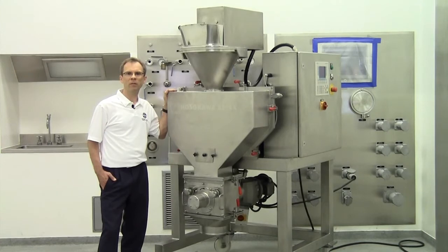The Alpine Pharma Pactor is a lab and small production scale compaction system designed to increase the size of powder particles into granules or flakes. This unit is capable of compaction up to 300 pounds per hour with a maximum pressing force of 30,000 pounds.